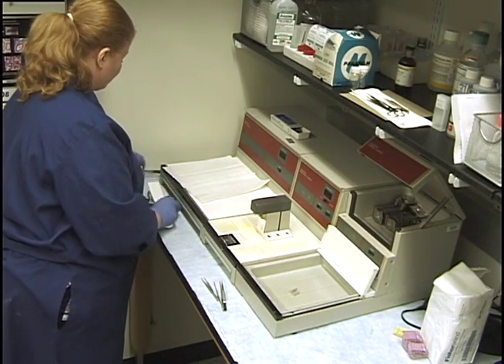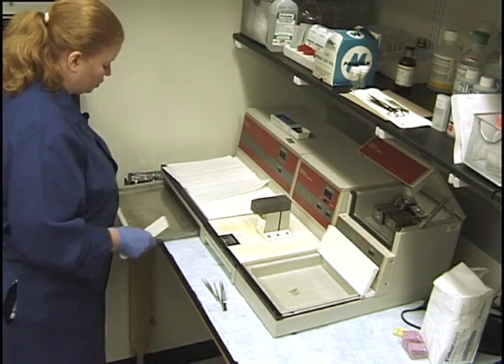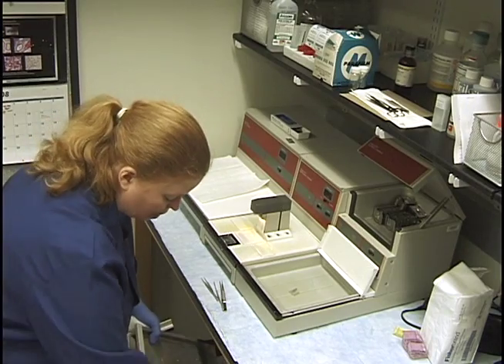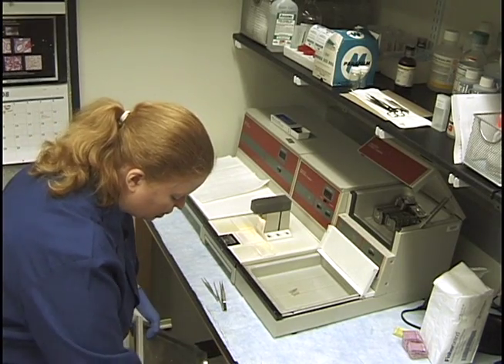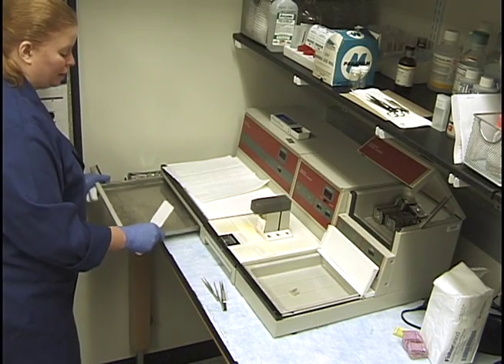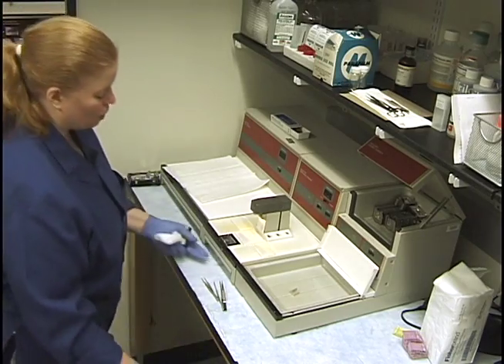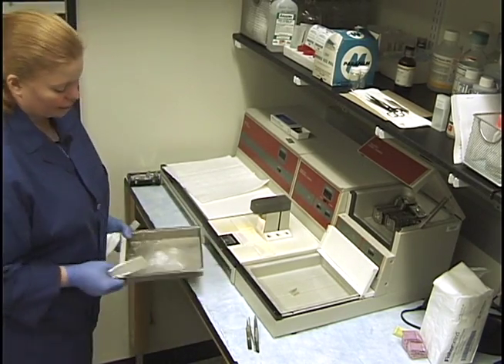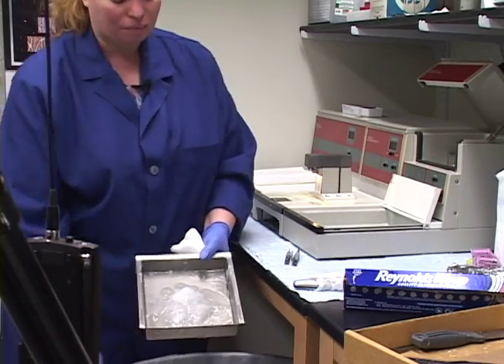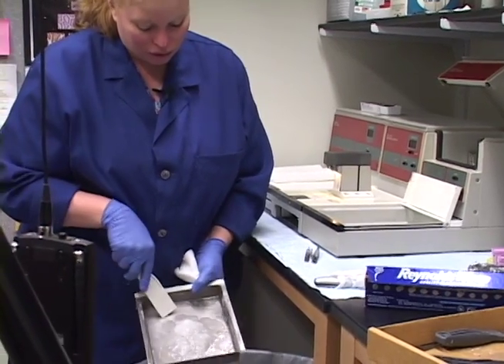We have two trays. There's one here that just gets a little bit from the edges - I probably clean that every few weeks when I think of it. This tray over here, however, I check every time, because it gets a lot of paraffin buildup from the dispensing lever, and that's going to need a good scraping out.